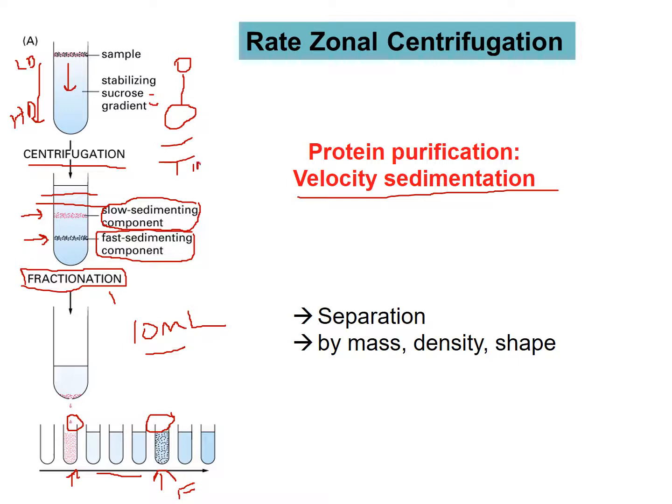Rate zonal cannot be done for too long, because given enough time, all these will pellet at the bottom and you haven't done anything. So there's a time issue here. You can't sediment for too long.